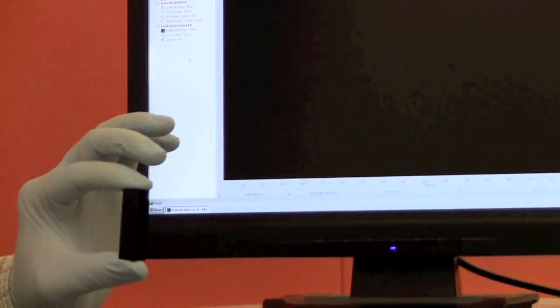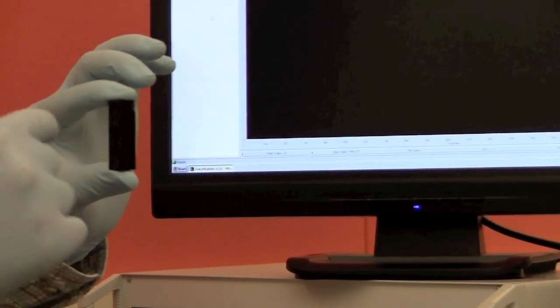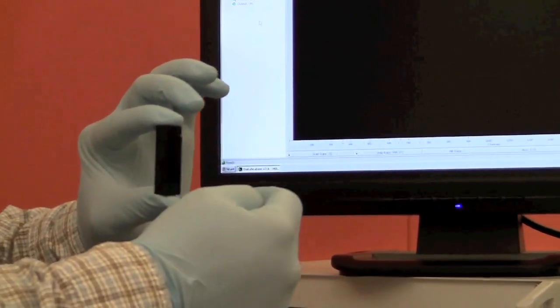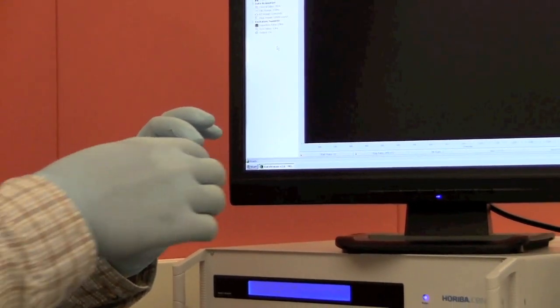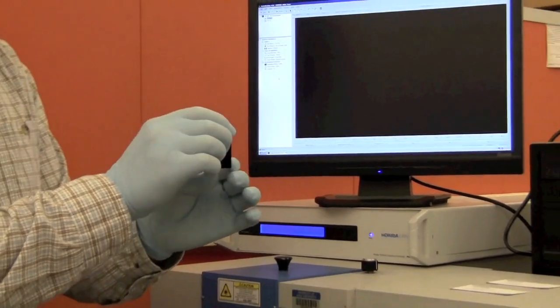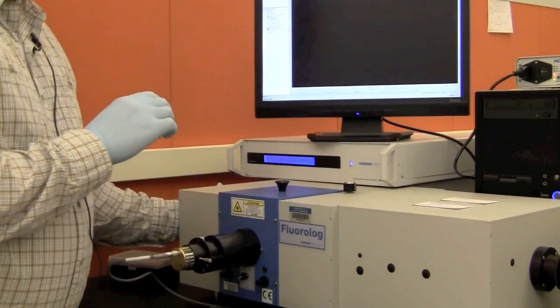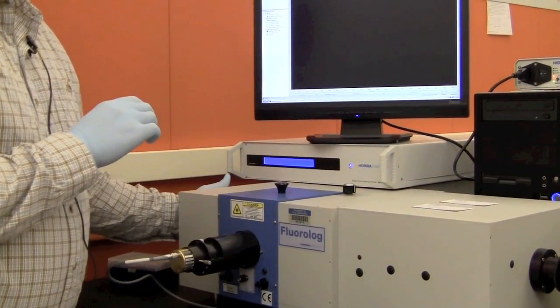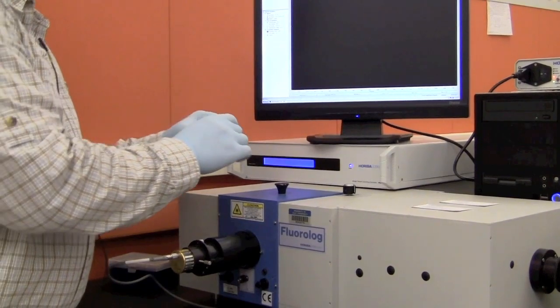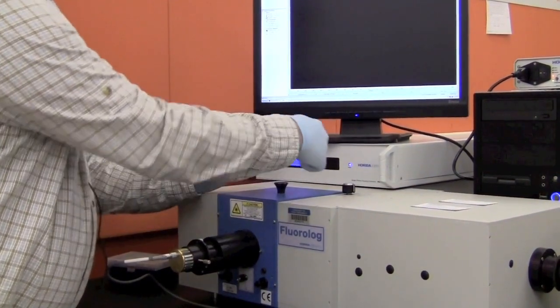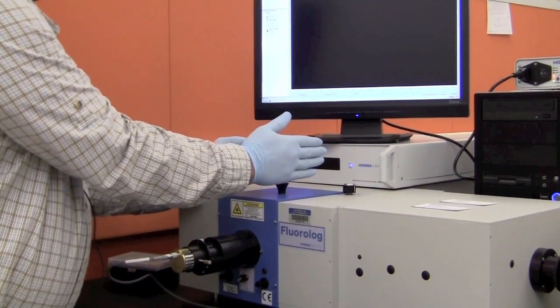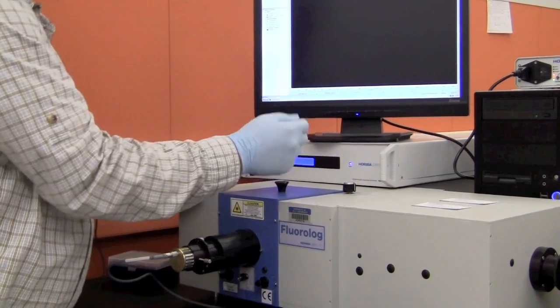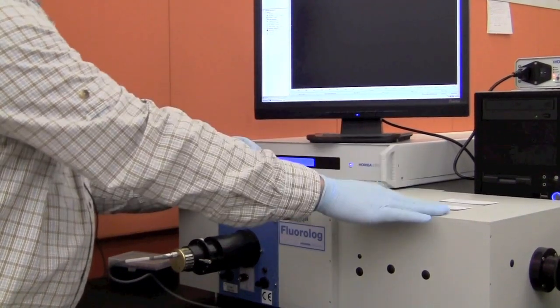We'll be using a typical micro-cuvette. These cuvettes are particular about orientation. There are three windows to view from. The side that you cannot read through needs to go to this side of the detector. The two windows you can see through need to go parallel to the laser beam, and the one window here goes to the detector.